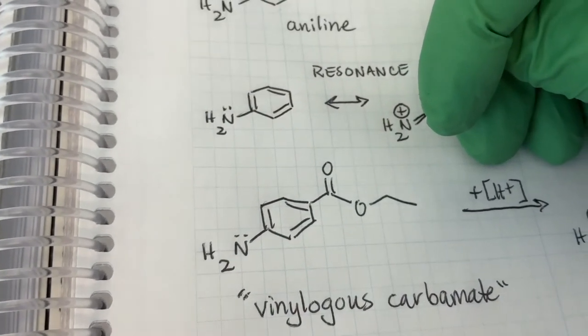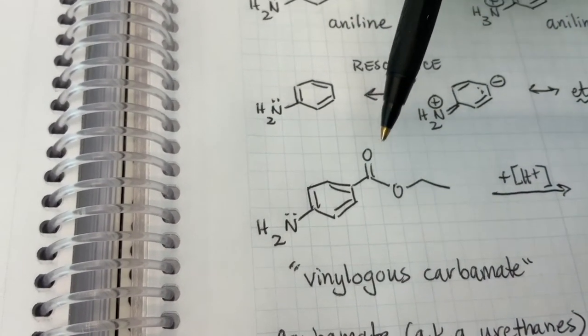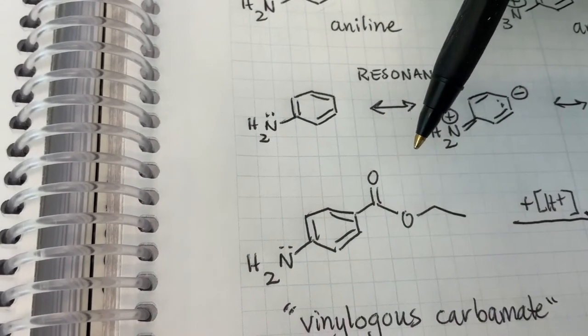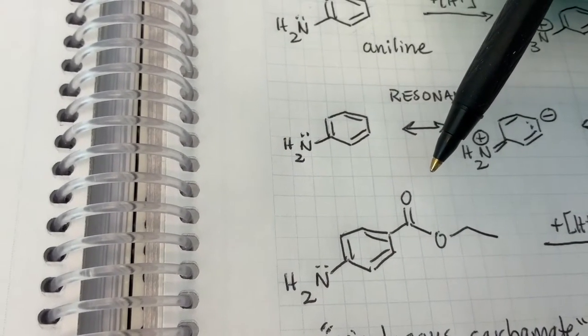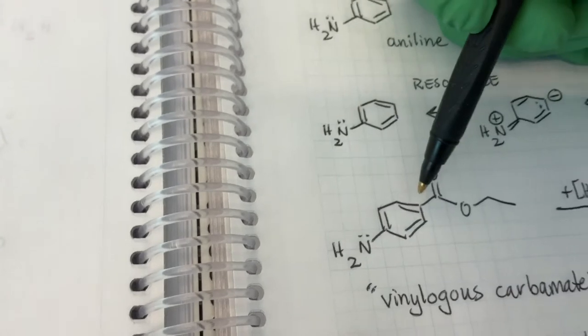However, we can protonate benzocaine. So this is the structure of benzocaine. We can protonate it, but we need to use strong acid. So the strong acid that we're going to use is hydrochloric acid. We're going to start with 3 molar hydrochloric acid. And what we're going to expect is that given the knowledge that these lone pairs resonate within the ring, we also know that the pi electrons could then resonate out onto the carbonyl oxygen.